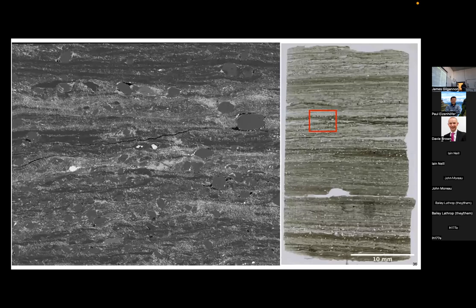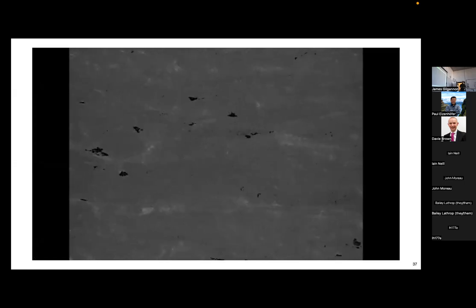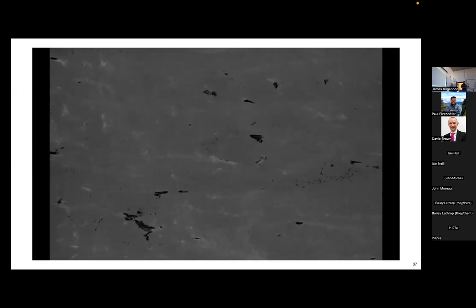We mapped large areas of this. Fortunately, you're going to see better images in a moment, but we matched large SEM images of this, like this area, for example, is here. If you look, for example, on the shoulders of that porphyroclast, you can see these sigma-shaped pores. So we started noticing that there was all this porosity, really large porosity, that we thought can't actually be real porosity. It must be polishing artifacts. But it's everywhere, it's through the whole sample. We'd also seen some hints of this in some samples from the Redbank shear zone in Central Australia as well. And unfortunately, only the audience online is going to see this well. That's a shame.